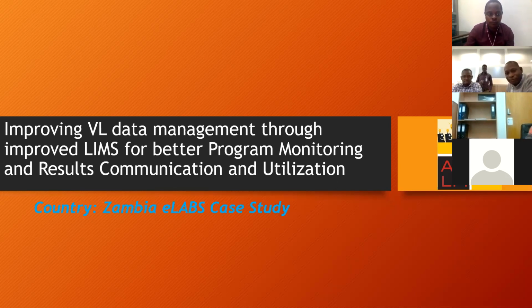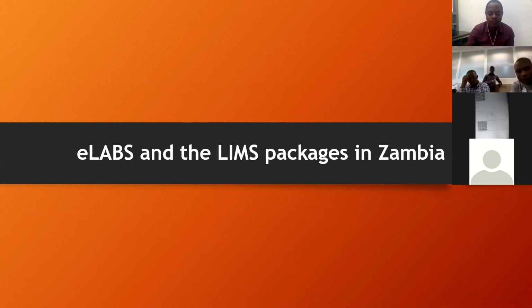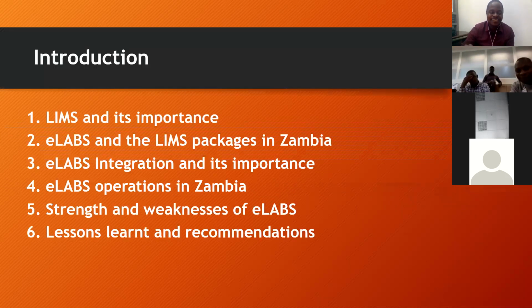I'll be presenting the viral load data management through the LIMS for better program monitoring and results communication and utilization through the eLABS case study from Zambia. Next slide, please. So the presentation consists of the LIMS and its importance, the eLABS and LIMS packages we have here in Zambia, the eLABS integration and its importance, its operations in Zambia, the strength and weaknesses of eLABS, as well as the lessons learned and recommendations.